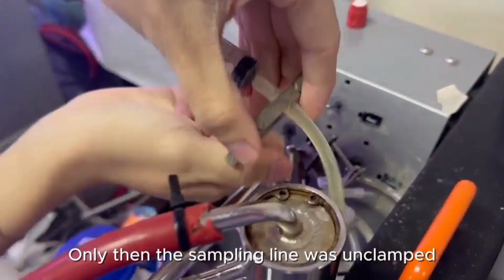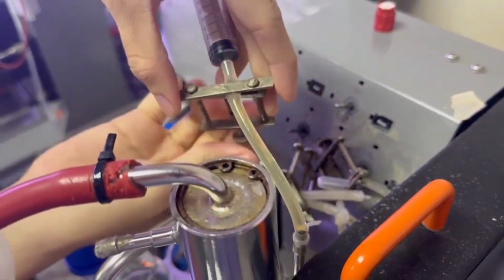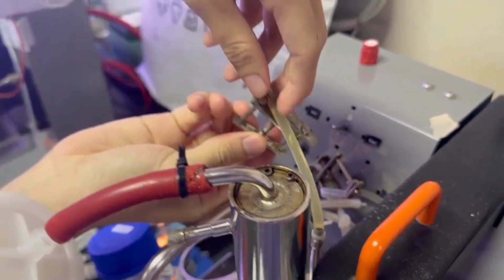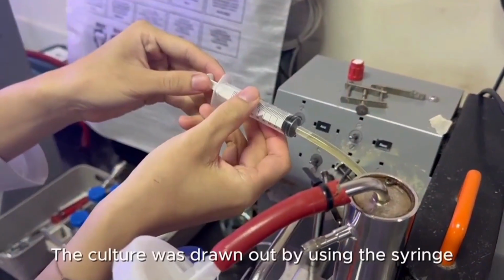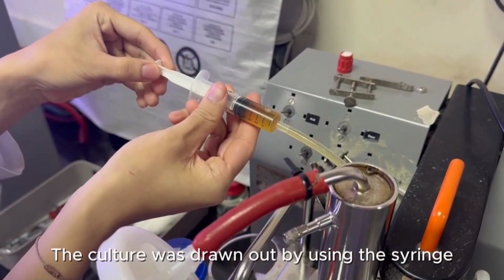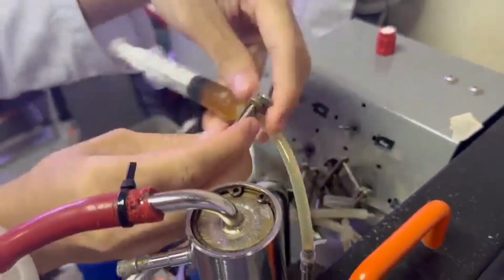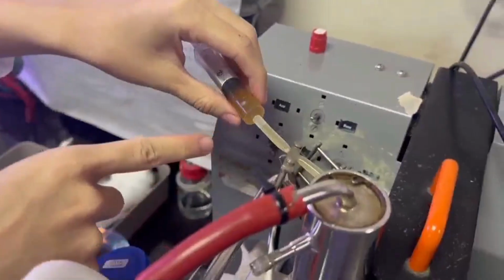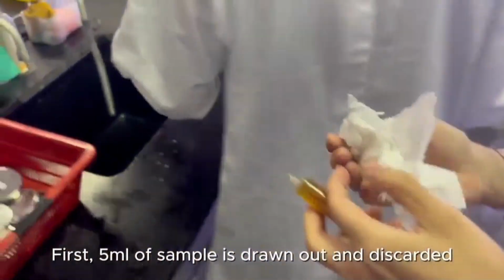Step 5. Sampling. Only then was the sampling line unclamped. The culture was drawn out using a syringe. First, 5 ml of sample was drawn out and discarded.